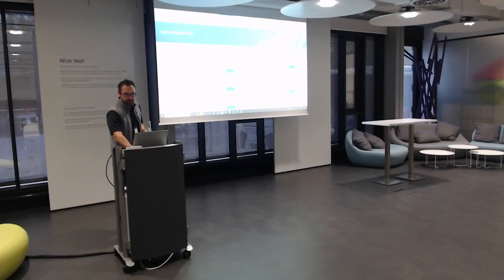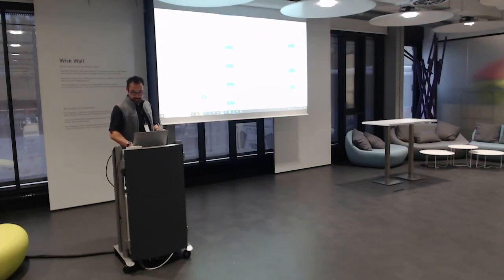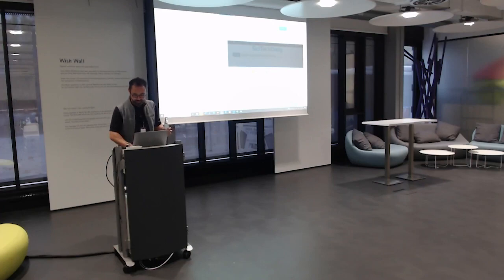first of all, we've been talking about the research suite. I don't know how many of you are already actively using it, but this is what the research suite looks like. You have login and password, just like any modern self-respecting SaaS application. You log in, you have a portal with multiple apps. So obviously, I'm here as an admin, so I have the possibility to configure, but to the end user, this is something where maybe you're just going to go to Signals, which is Signals Notebook, and you click it, and you're going to land in Signals Notebook. So this is my personalized dashboard. Connection is via my work phone, so apologies if it's not loading super fast, it's okay.